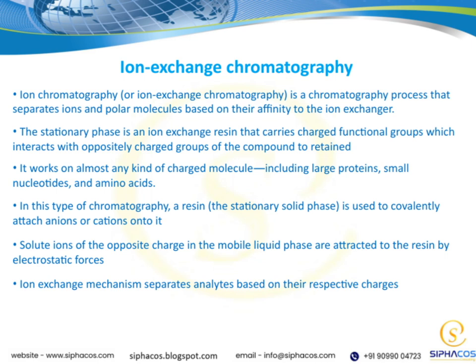This method is incredibly versatile because it works with almost any charged molecule, whether we're talking about large proteins, small nucleotides, or amino acids. The resin itself is a solid phase, and what's interesting is that it's covalently bonded with either anions or cations. When the sample, or solute, is introduced in the mobile liquid phase, ions of the opposite charge are attracted to the resin through electrostatic forces.